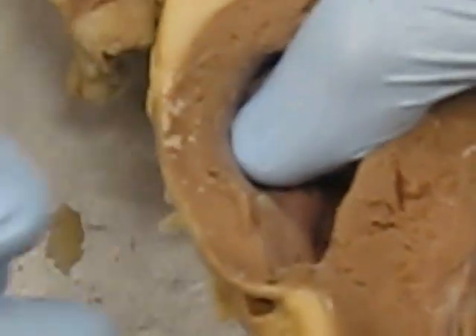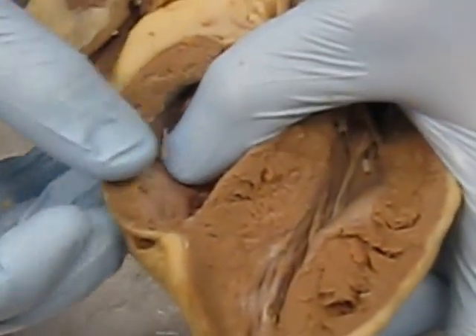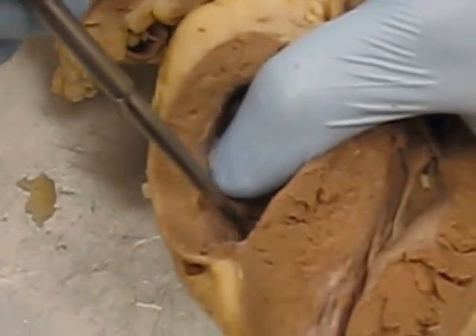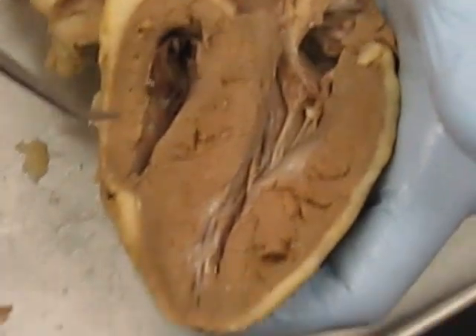From the right atrium we're going to travel down the tricuspid valve and into the right ventricle. In the right ventricle we can see a network of muscles called trabeculae right here. These are still muscles but they are different from the myocardium.